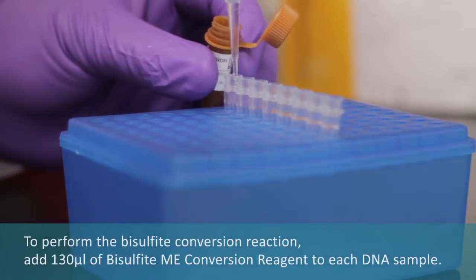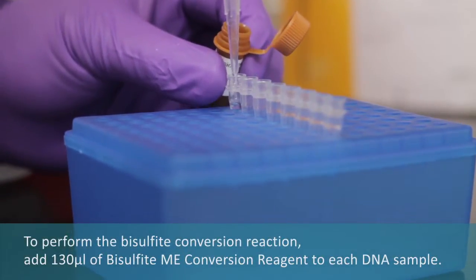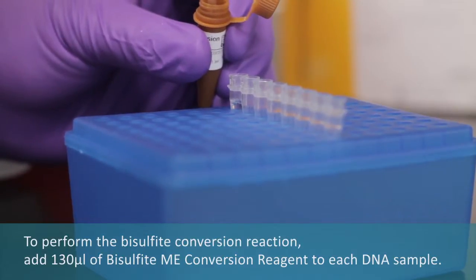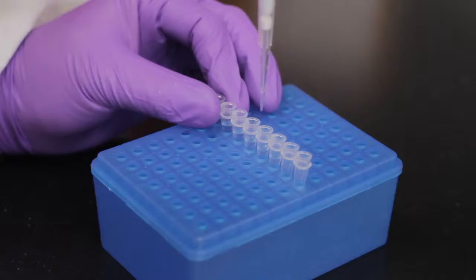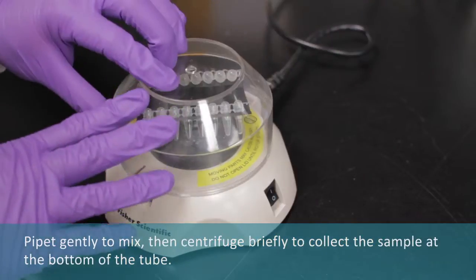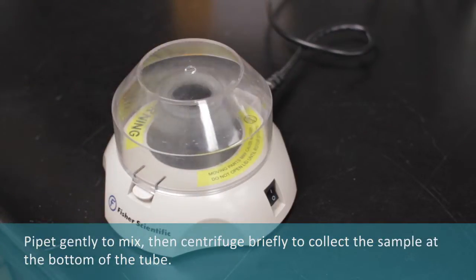To perform the bisulfite conversion reaction, add 130 µl of bisulfite ME conversion reagent to each DNA sample. Pipette gently to mix, then centrifuge briefly to collect the sample at the bottom of the tube.